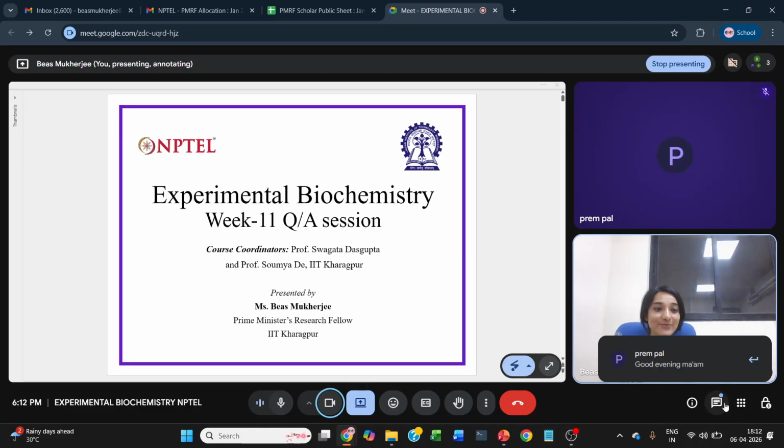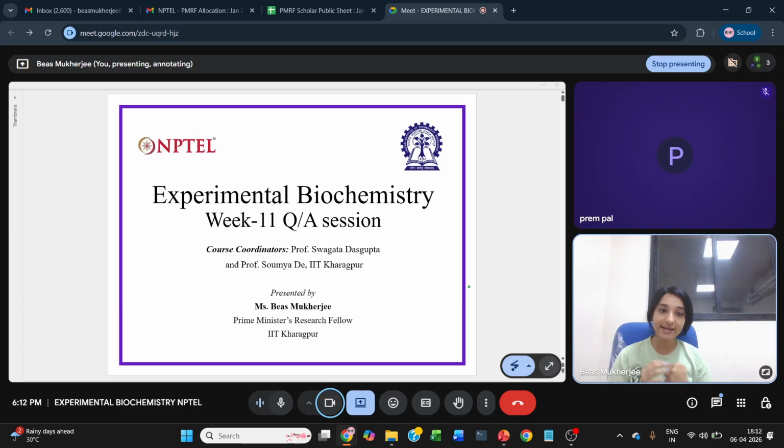In today's class, we are going to talk about some of the quantitative methods of protein ligand interaction.